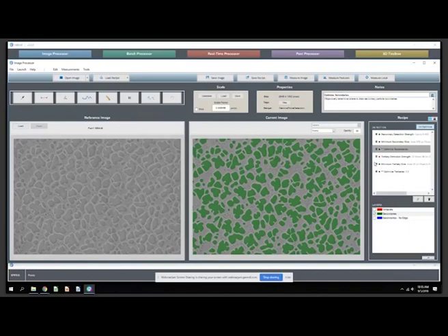And MIPAR provides a non-destructive auto-recorded algorithm builder that lets you do what-if scenarios and go back and try new things without having to spend time writing macro code or erasing your last bit of work to go back to a previous state or struggling with multiple windows. It's all right here for you, and the effort that you put in is just on solving your problem, not using the software.